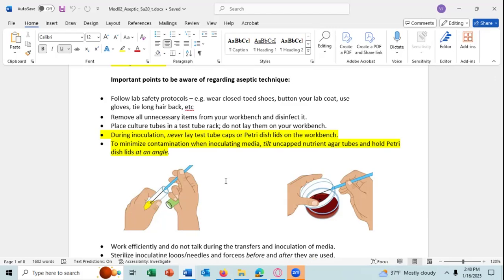That way, if something falls down from the air, it has limited surface. You can see it's got limited surface to come in. Most of the time, it'll fall down on top of the side of the tube. We don't care if it hits the side of the tube.